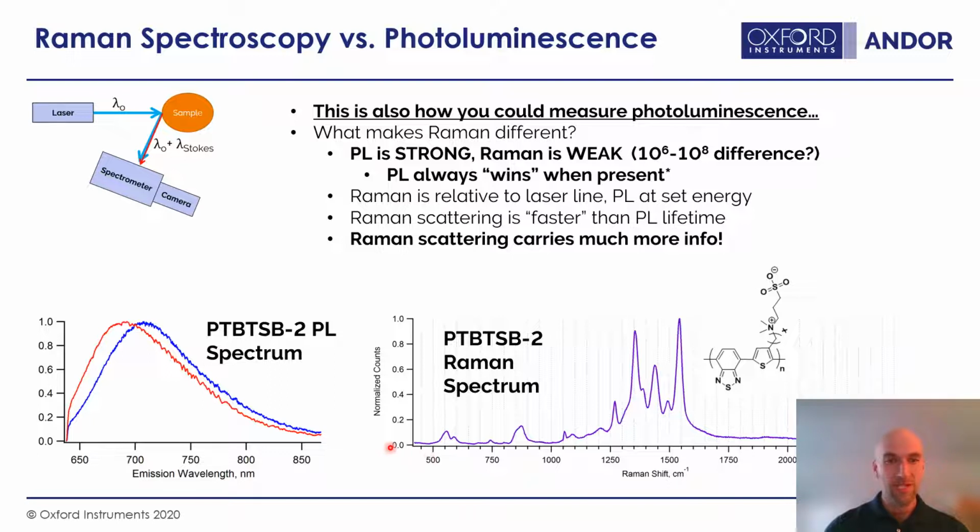But you can see, instead of one large, broadly spread out progression, you have lots and lots of small peaks, probably about 20 or 30 overlapping narrow peaks. And we'll talk about what these mean. But if you were to record just simply in a notebook or a spreadsheet, how much information would it take you to record the spectrum? Well, you'd have to go through each peak and say, okay, here's the center energy, or here's the center wavelength, here's the width, here's the intensity.